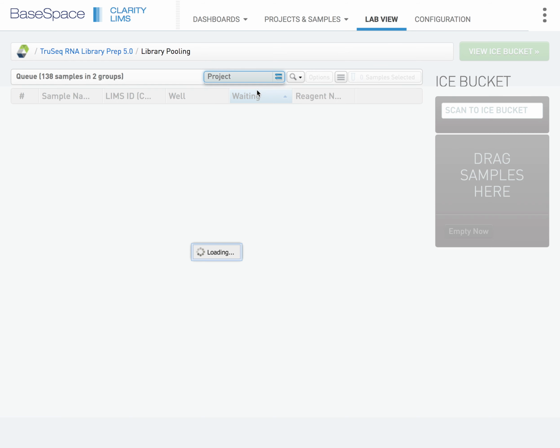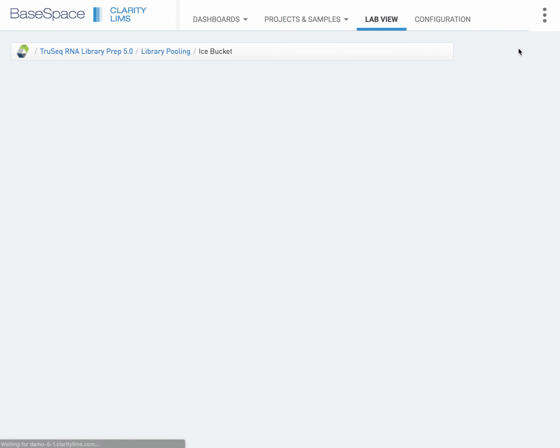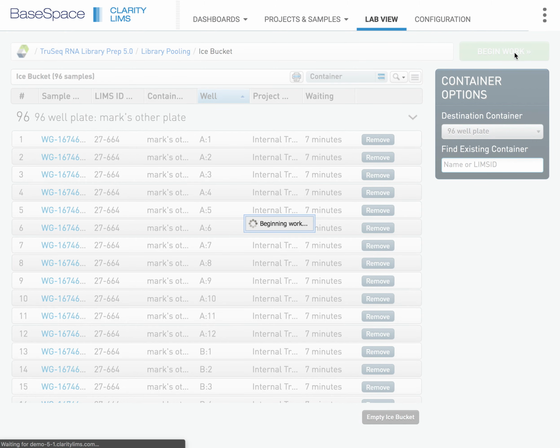So I'm going to just choose the samples from the project that I'm working on. We'll add those to the ice bucket. And some people might store their pools in tubes or plates. I'm going to choose plates for this one, although I accept that may be a little unusual. And let's begin work.